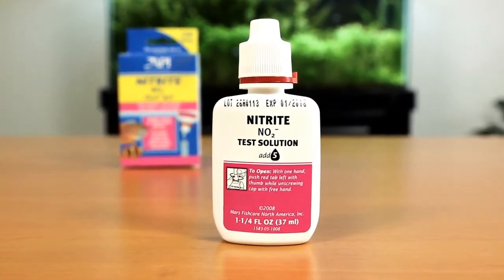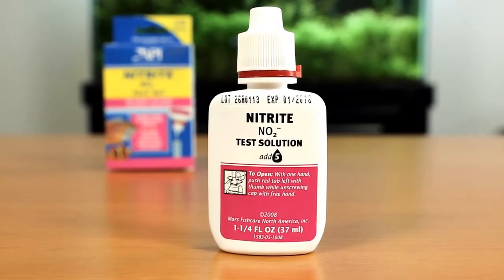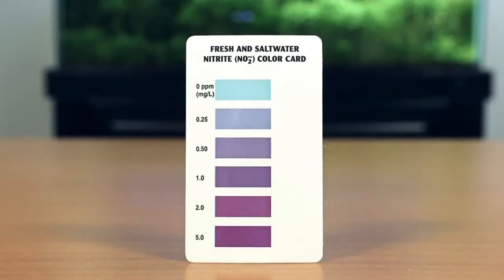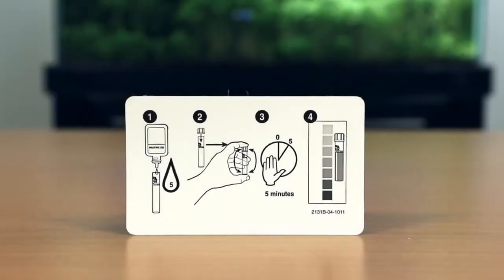The API Nitrite Test Kit uses just one bottle of test solution. The nitrite color card is calibrated for both fresh and saltwater. Testing instructions can be found in the manual and on back of the color card.